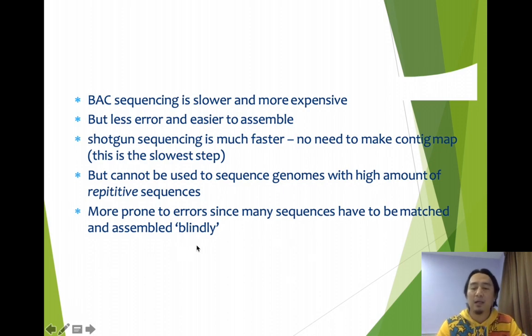Because it cuts by shred DNA mechanically, you tak pakai enzyme, just cut blindly lah. So it will increase the error of the sequencing later on. Okay, it will affect the results.